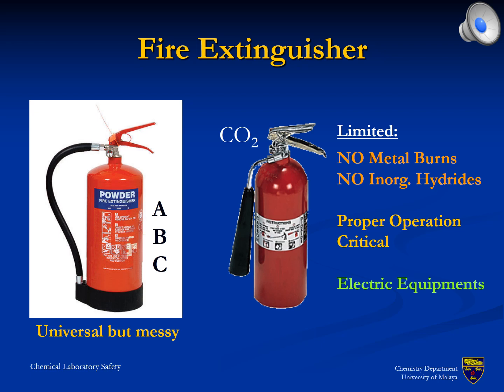There are two types of fire extinguisher available for chemical laboratories. These are powder, ABC, and carbon dioxide. Both extinguishers target to block oxygen from reaching the fire, thereby stopping it. While powder is safe for practically any fire, carbon dioxide is not compatible with burning metals and organometallic compounds. On the other hand, it avoids damage to electric devices and should, therefore, be used if the fire is suitable. However, in doubt, powder shall be the choice, since the damage by fire typically exceeds the damage to equipment by far.